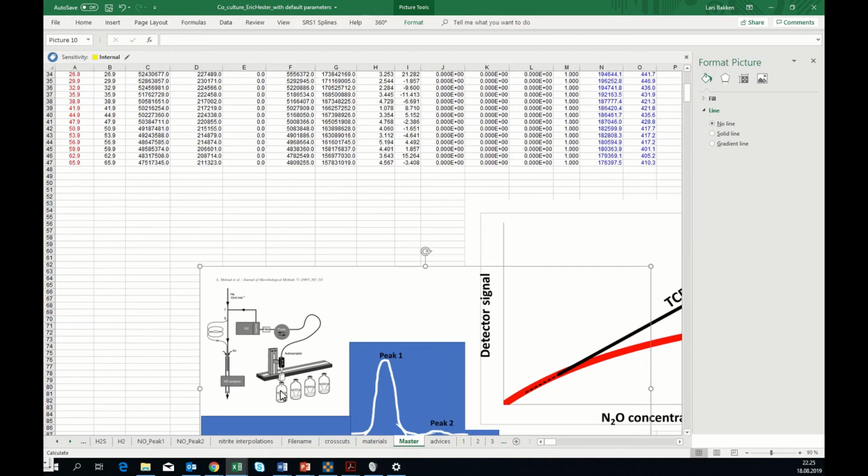At the same time, if the vial is anaerobic and free of N2, or almost free, there will also be a significant small leak of nitrogen and oxygen through the tubing and through membranes on the way from the sampling needle to the GC and back. And that sends a tiny little bit of oxygen and nitrogen into the vial. So both the loss by sampling and the leakage of N2 and O2 has to be taken into account when calculating the true rates of oxygen consumption and nitrogen production.